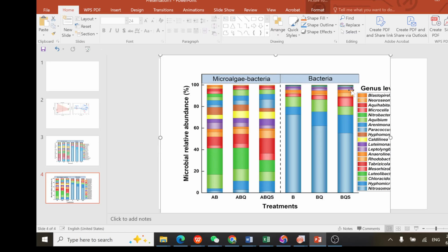So for the sake of time, let me stop here. You need to export. Just export it and you get the full picture. But this is how you plot it, and you have a beautiful bar chart plot.